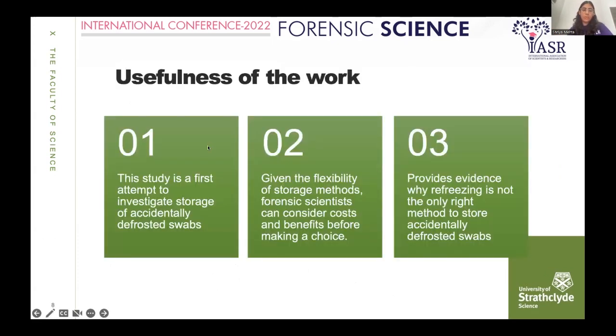This study is a first attempt to investigate storage of accidentally defrosted swabs, as there is very limited guidance on proper storage of evidence regarding temperature fluctuations in DNA swabs. Given the flexibility shown, forensic scientists can now consider cost and benefits before storing swabs. If there is no space in the freezer, they can store them outside at ambient conditions, provided swabs are processed within a week. This study provides evidence that refreezing — the current standard procedure — might not be the only right option, and further research is required.